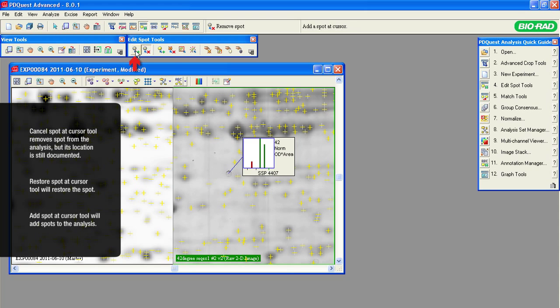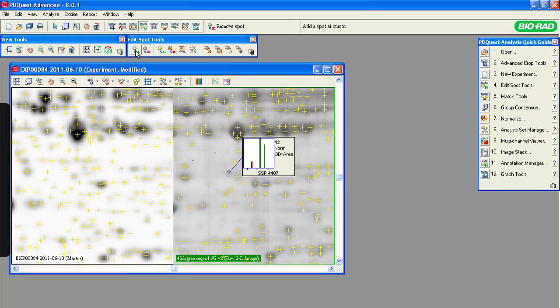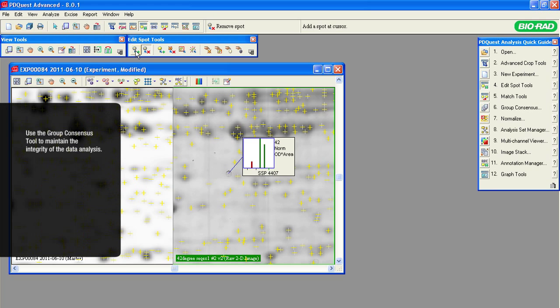Use the Add Spot tool with great caution. Add a spot only when there is significant information to support your decision to manually force a spot into the analysis process. By forcing the individual spots into the process, you will compromise the consistency of your experiment. To maintain the integrity of the data analysis, spots should be added or removed using the Group Consensus tool.